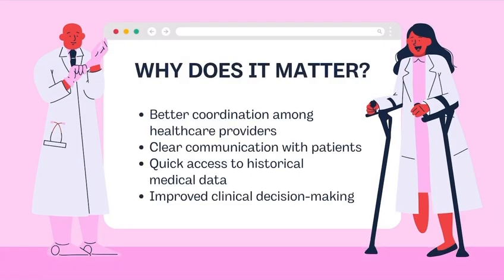In laboratory settings, having a well-organized report like this means better coordination among healthcare providers, clear communication with patients, quick access to historical medical data, and improved clinical decision-making.